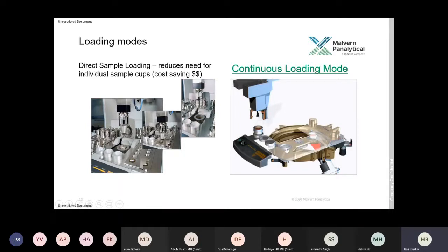What this means is that you are stabilizing the next sample, ready for the measurement, which improves the precision of your measurement and the reproducibility of your results. This continuous loading can keep going for every sample in that batch. It is quite a unique technique, because this dual position sample loading is not usually available in some of the other well-known brands.